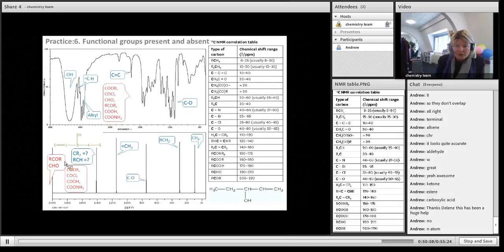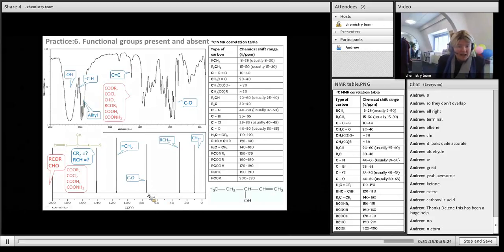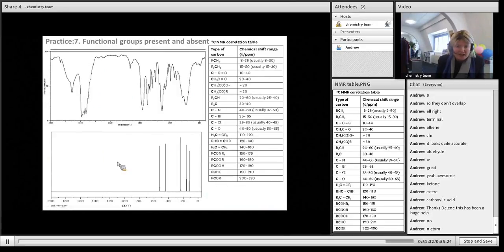So if we look at it, can you see carbon number 1 is the one that's the most substituted double bond. Carbon number 2 is the terminal alkene. Then we get a carbon with an OH that's been affected by both the alkene and the oxygen, and that's why it's further downfield. It's not sitting at 60 anymore, it's gone down. Number 4 has been affected by the OH as well, because remember, up to 3 bonds away it can find it. But number 5 is far enough from the oxygen, it doesn't really feel it, so it's sitting where methyl is, at around 10.